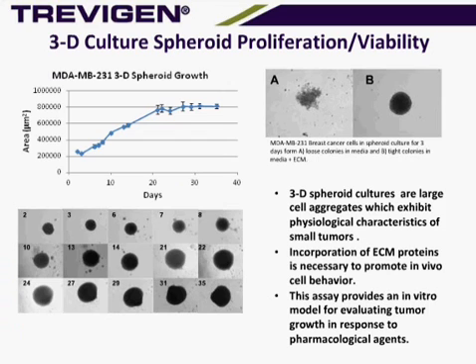In the pictures, in the upper left-hand corner of each picture is a number, and that number corresponds to the days post-spheroid formation. And what we see is that the spheroids will actually continue to grow for 20 days. They'll reach a certain size. For these cells, it was a little over 1 millimeter in diameter. And then once they hit this certain threshold, the spheroid cannot grow any larger.